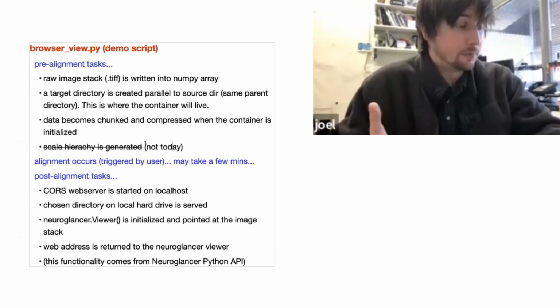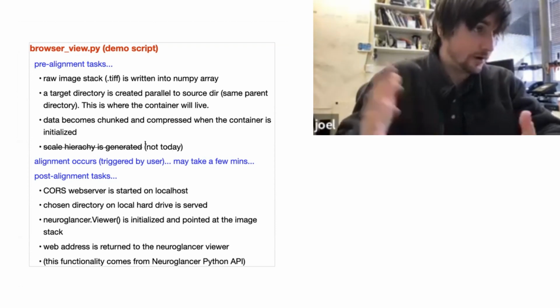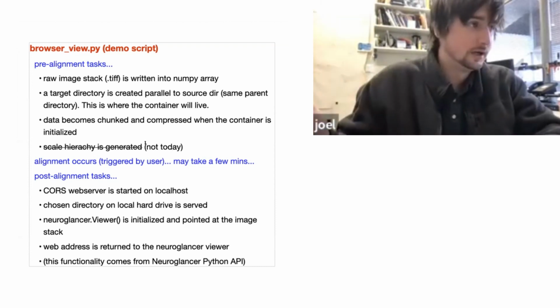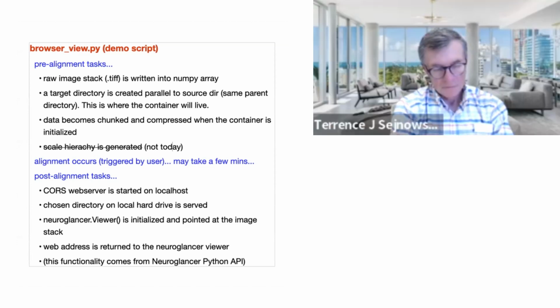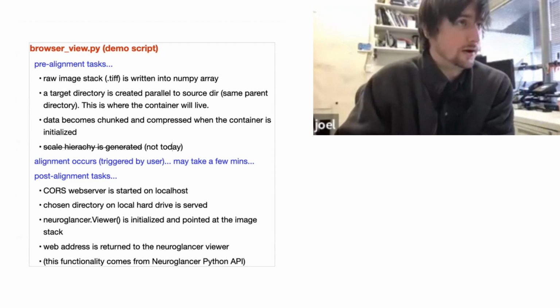And then we can also, if we wanted to, the NeuroGlancer client code, the code that knows what a NeuroGlancer viewer is, that can run, it doesn't have to be running on my computer. I don't want to confuse people, but the client side NeuroGlancer code can be running on any machine anywhere, and this is all done through JSON.